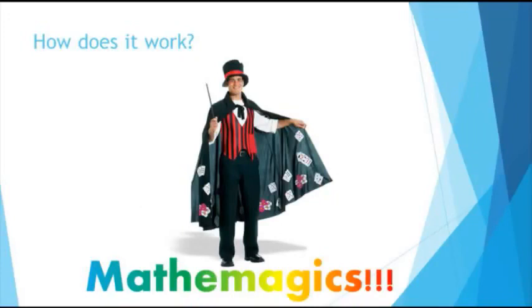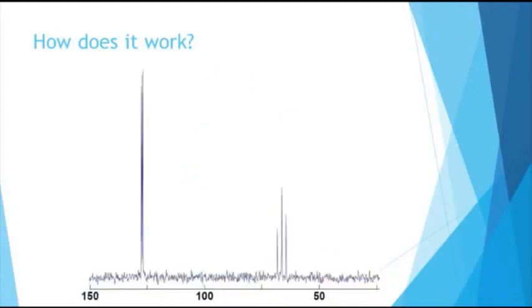So as far as I can tell, it is mostly magical. But if you ask a mathematician, it's actually Fourier transforms, which, again, I can't explain, but someone here will be able to. And what you get at the end is this trace which shows you the frequency and the amount of energy that came out at that frequency. And at this point, you can start to do analytics. So you might be able to say, okay, I know that this peak corresponds to water. And then you can start knowing and picking apart the different things in NMR.